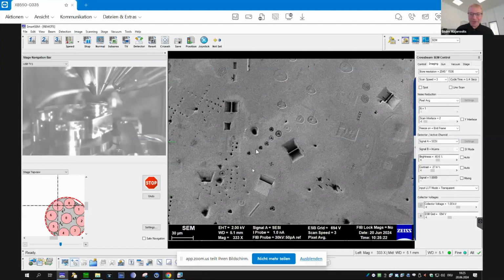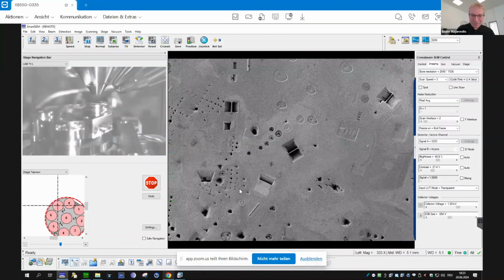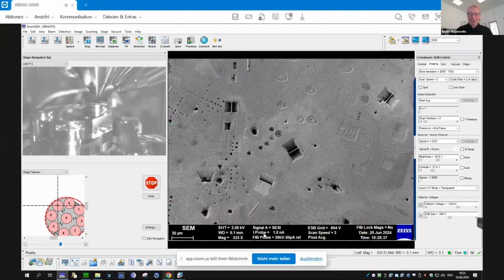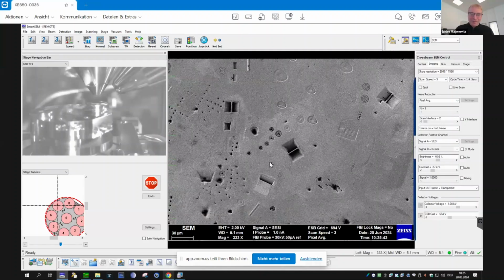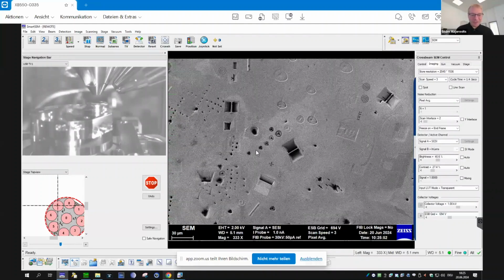So talking about this, I had this example of Control D, and if I press Control D, which I will do now, you see that at the bottom there's the so-called data zone, which I can display or hide. This is just one possibility. Another possibility is, for instance, what I have set up. I mentioned that some function keys are user editable.